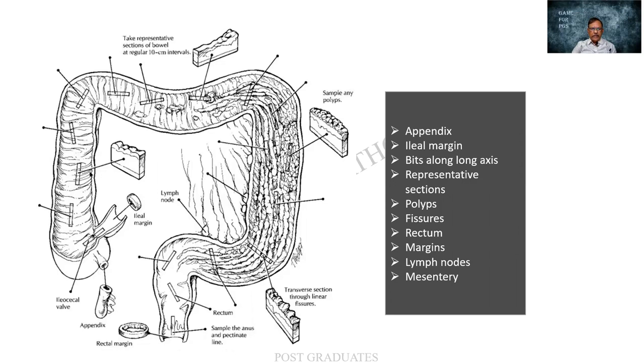Wherever they have given the bits, it is in a longitudinal manner. So it is parallel to the long axis of the bowel, wherever it is. That is the dictum. Secondly, they have taken from the resected margin. It can be either an annular, a downward shape, or a circumferential one. But it can also be longitudinal. This is also possible. This is actually more important when the tumor is towards the end. Either of these should be there, but we should be careful to mark the end that is towards the resected margin and another end that is more proximal. So this will be important.